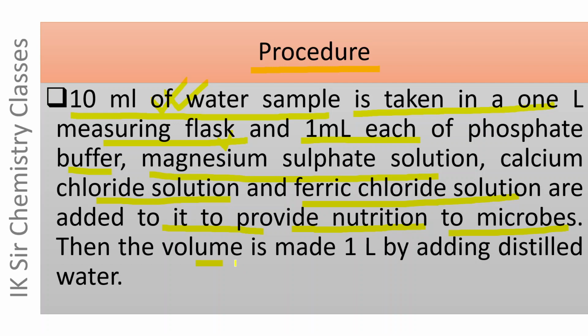Then the volume is made 1 liter by adding distilled water.